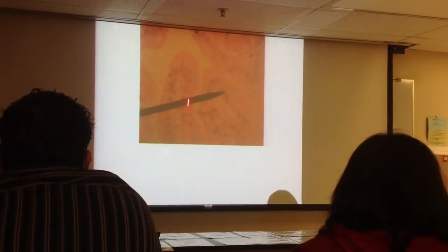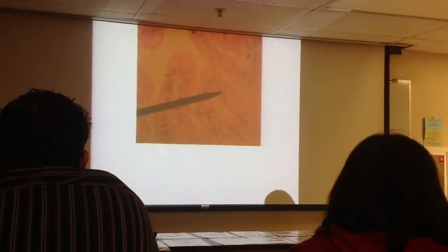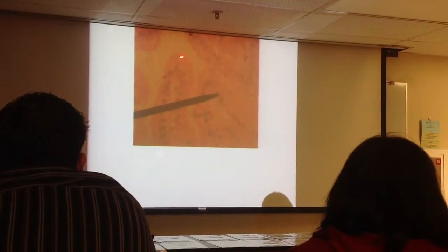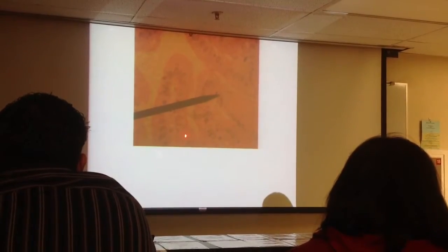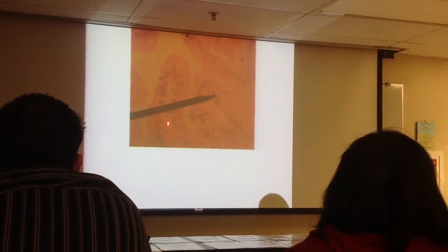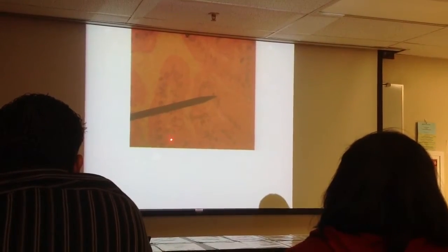What's that whole finger-like thing? Villi. Villus. What's the function of that? Increase surface area. What's that broad category of tissue in the middle? Connective tissue, and that's that lamina propria we just finished talking about.